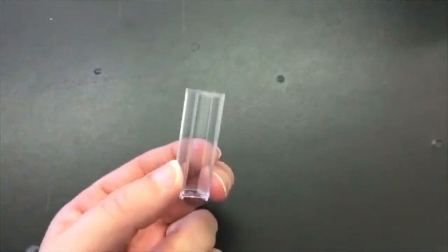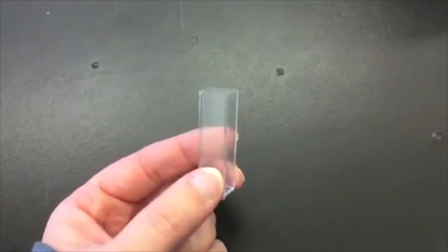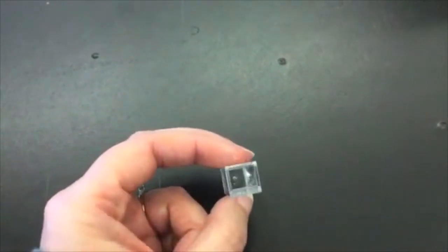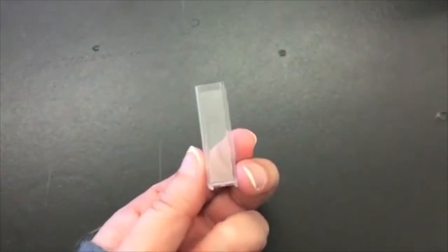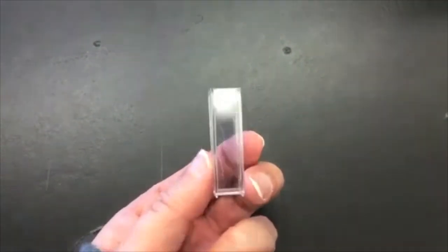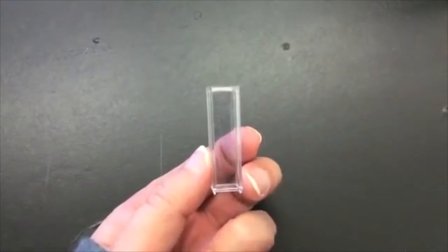These cuvettes are a little different than the cuvettes we have used in other labs. You will notice first they are square. There is a side that has ribbing on it and a side that is smooth. We want to avoid touching the smooth side because this is the side that light will pass through.